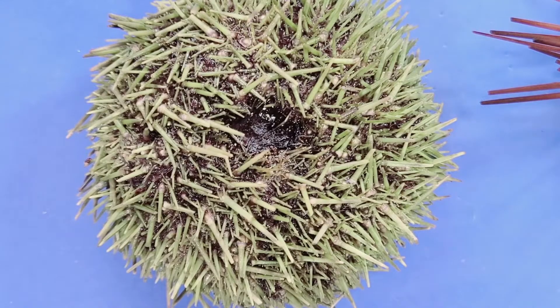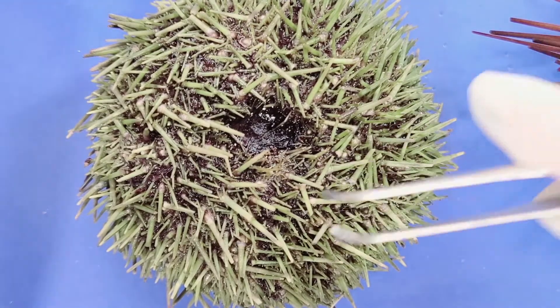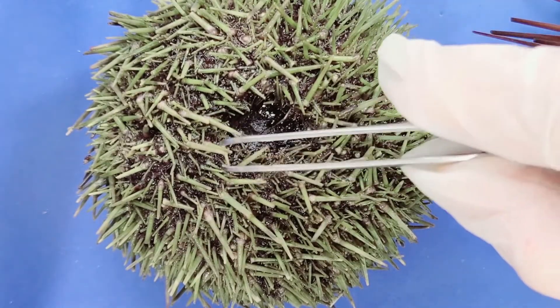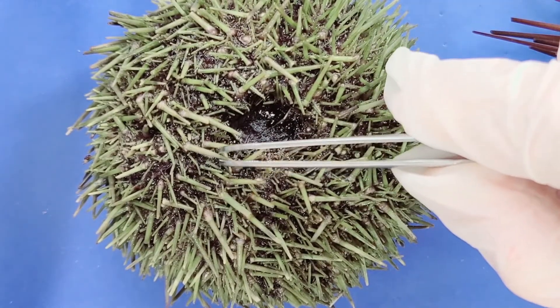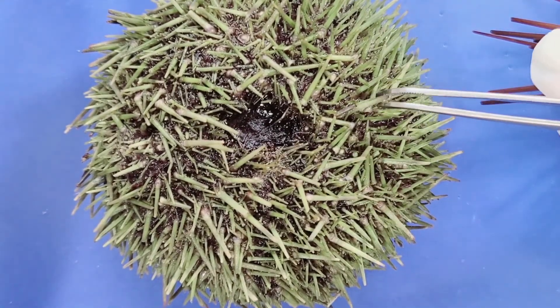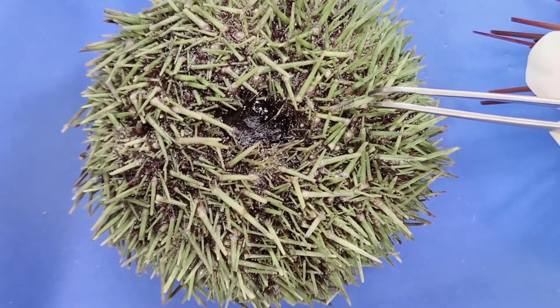Importantly, they don't have a 360-degree range of motion — just like your shoulder joints, there is a point where they don't move beyond. For example, this one moves this way but won't move past that point, and this one moves this way but won't move past this point.